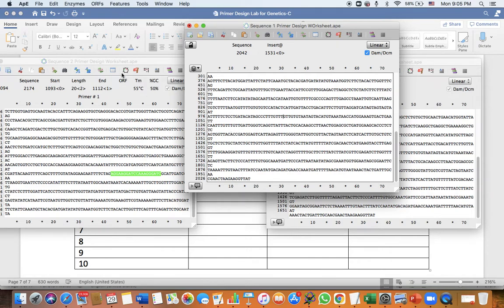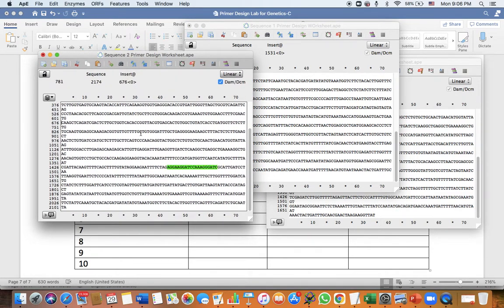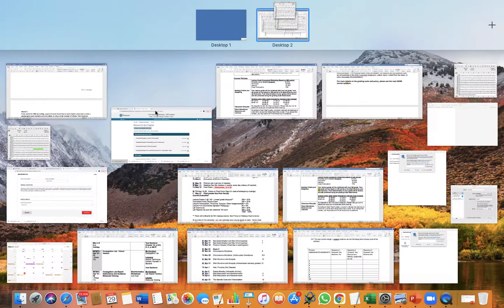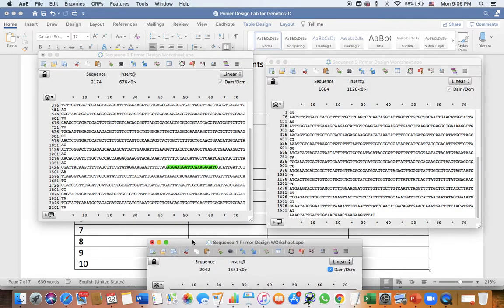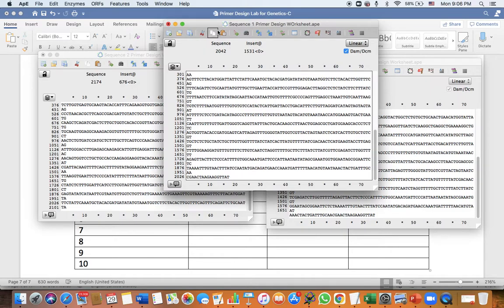One of the things that you could do, even without looking at the tabs, is by looking at the information that you're given within the sequences themselves. Say, for example, you look at these sequences here. These sequences here tell you whether there's an insertion, a deletion, or it's full genomic DNA. How am I going to predict or assume that is the case? Look here for sequence number.